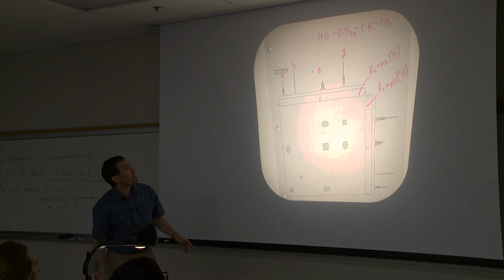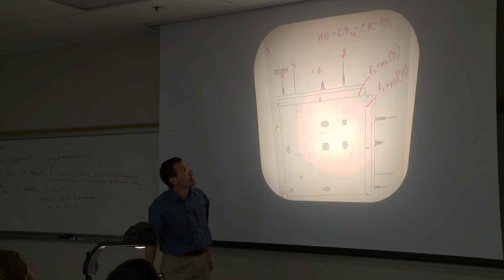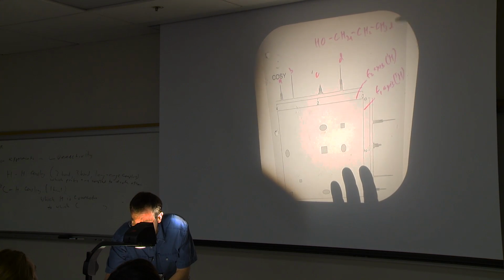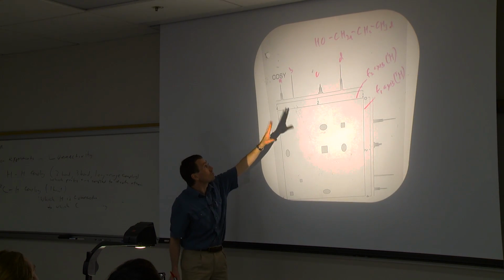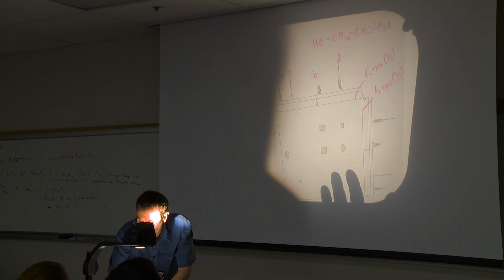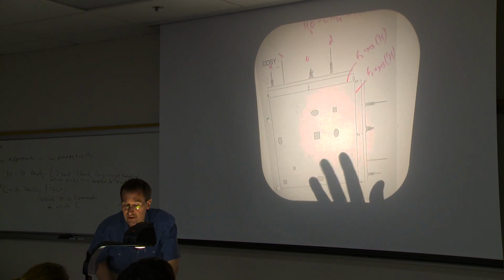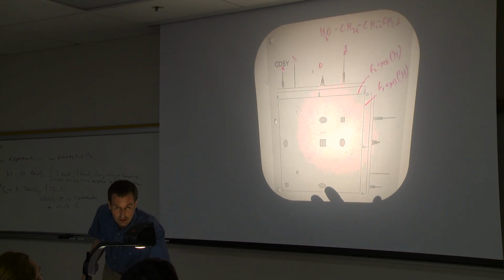And you'd probably recognize, oh yeah, that triplet that looks like it's about 0.9 parts per million or thereabouts, that's probably D. And this sextet that's pushing 2 parts per million, that's a methylene group that's beta to an electron withdrawing group, that's C. And the OH, I said, well, OHs often don't couple. There's your singlet.